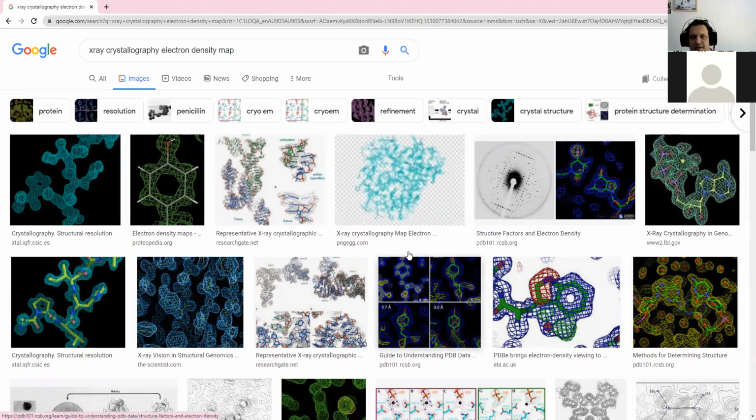There's the idea called the angstrom, which is how good the image that you'll get. The lower the angstrom rating, so an angstrom rating of 1 is almost perfect. 3, 4, 5, 6, even worse. But that basically gives you a clarity of what you're looking at.